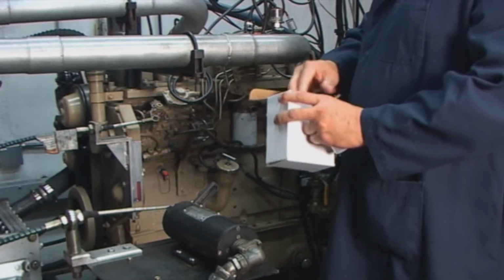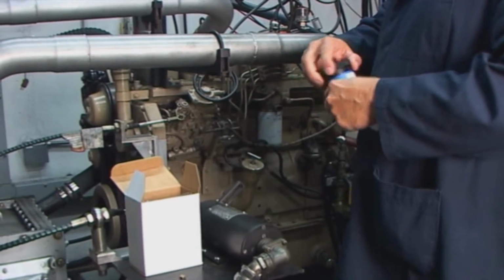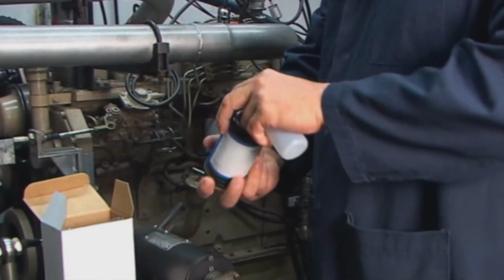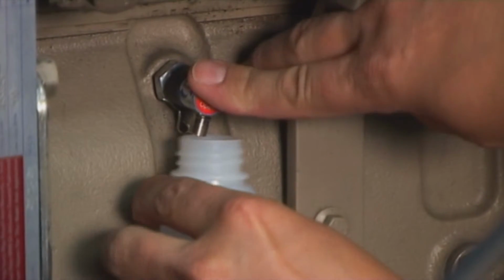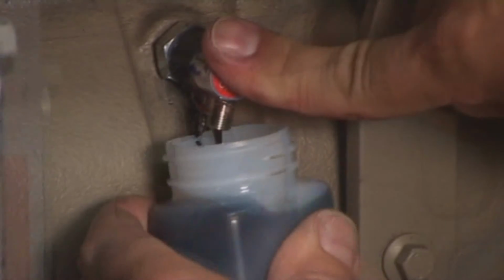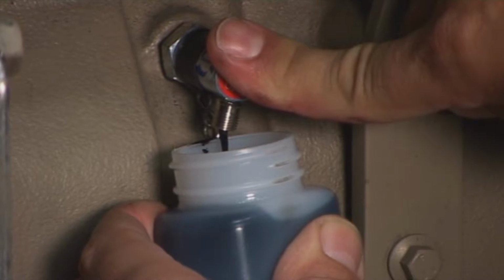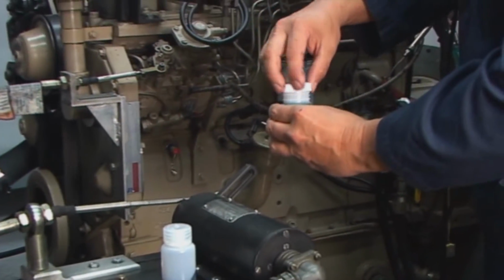To take advantage of the Donaldson Oil Analysis service, simply follow 5 important steps. Collect the oil sample by removing it from the engine or component while it is running, if it is safe to do so, or within 30 minutes after shutdown. The sample should represent the true condition of the lubricant at the time of sampling, or the reliability of the test results can be dramatically affected.